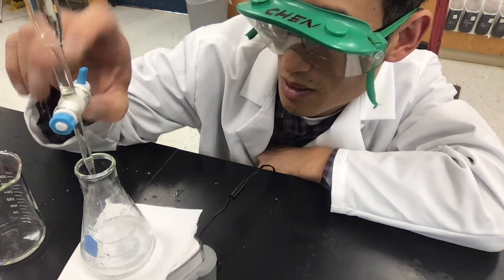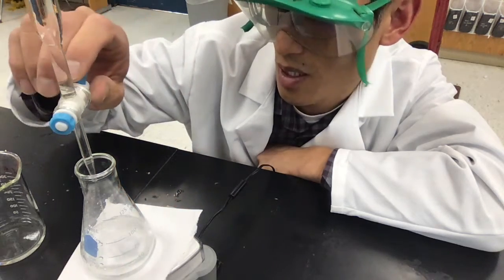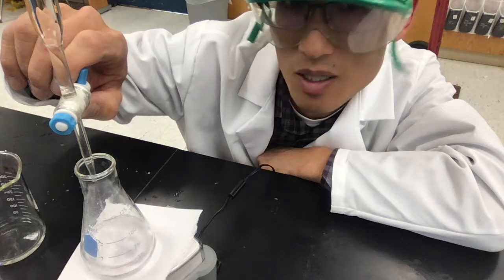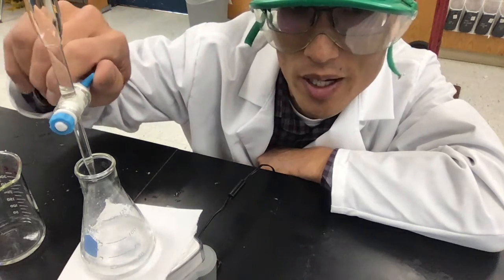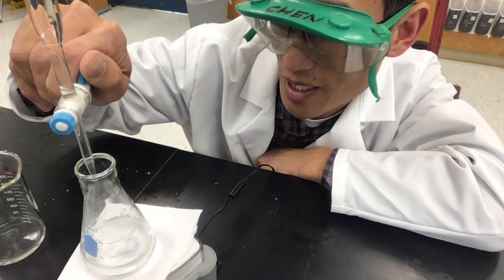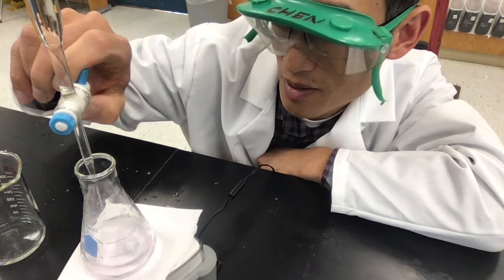Okay. So you can see it's starting to change a little bit. You can see a little bit of pink there. Okay, so you normally slow down. You can see that went away. So I'm going to add some more. But this is to get a rough estimate of where the endpoint is.